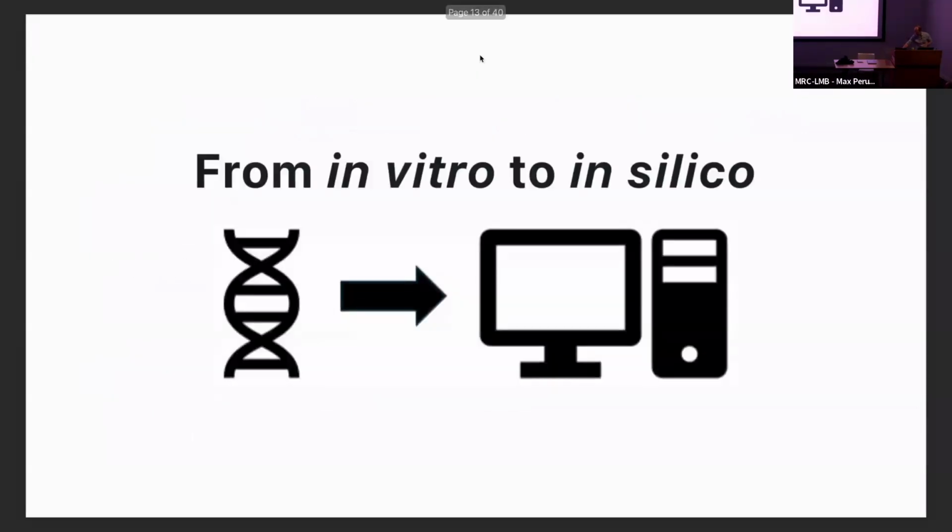I wanted to talk a little bit about the sequencing technology, because whenever you perform a sequencing run and then have to analyze the data, it's important you understand exactly what you're getting back. For example, the results you get back may not begin with the sequence of interest from the genome.